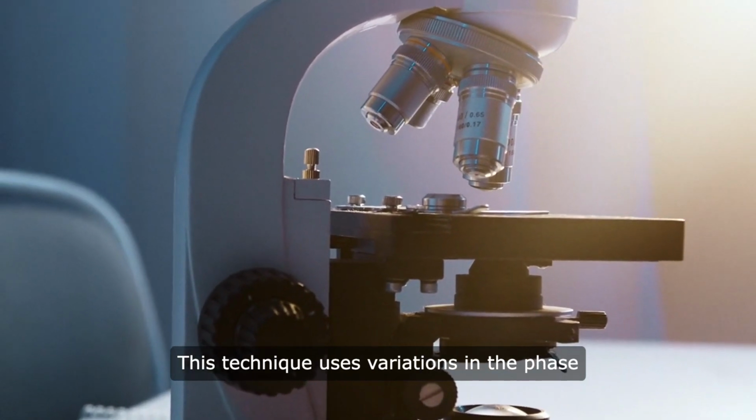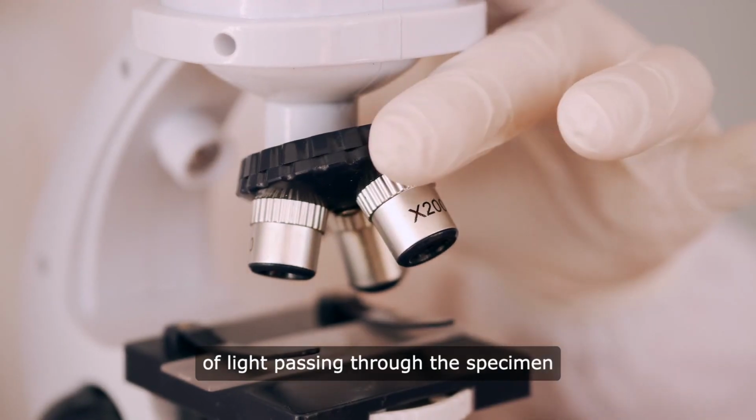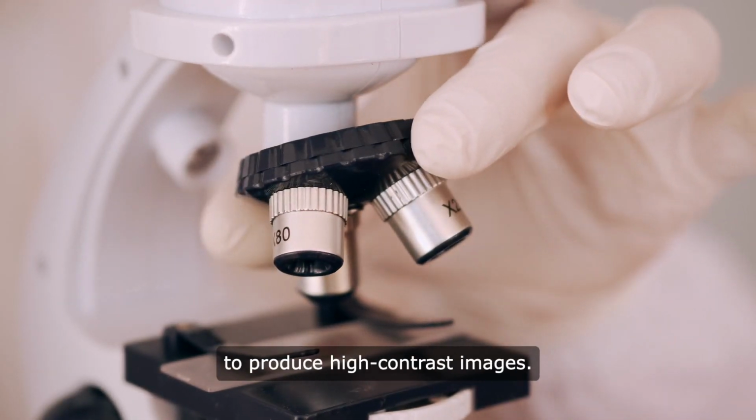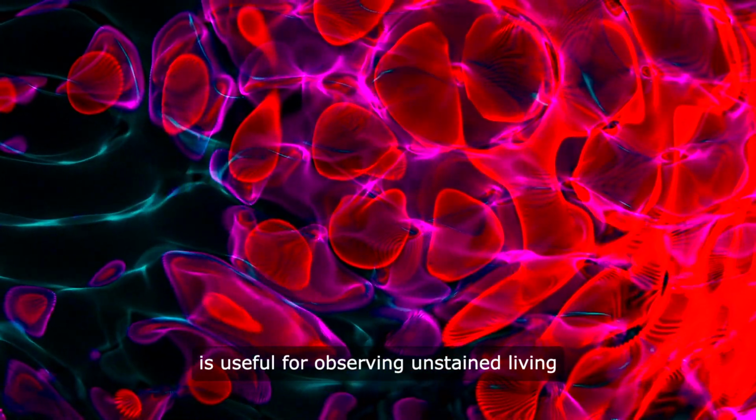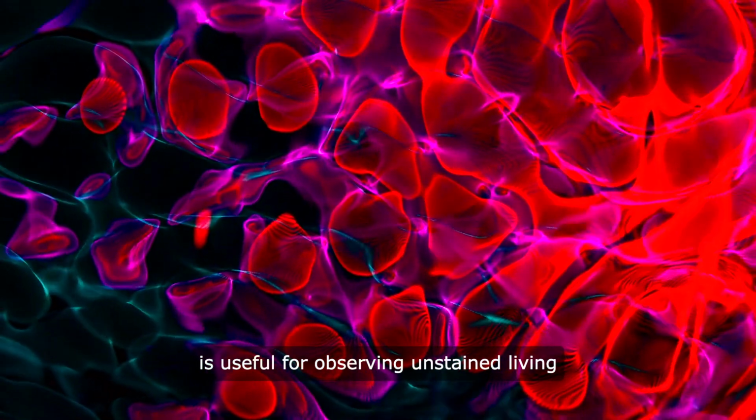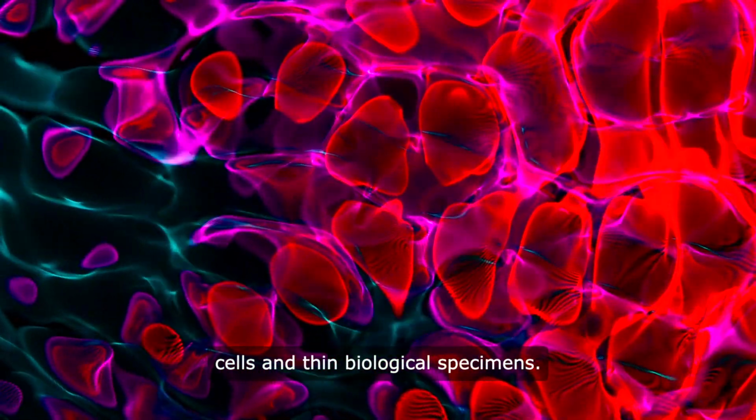This technique uses variations in the phase of light passing through the specimen to produce high-contrast images. Differential phase contrast microscopy is useful for observing unstained living cells and thin biological specimens.